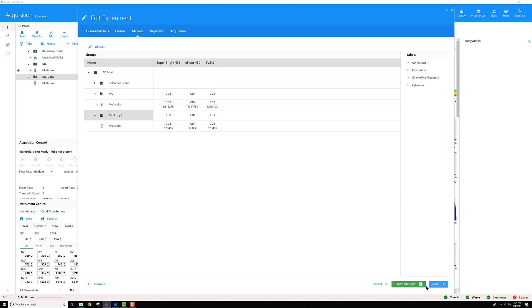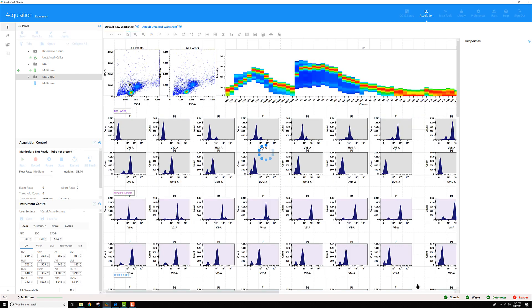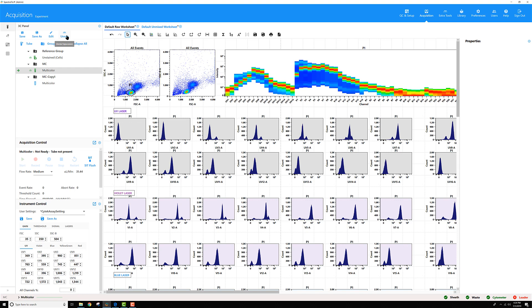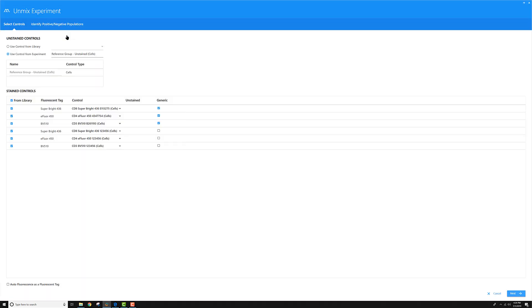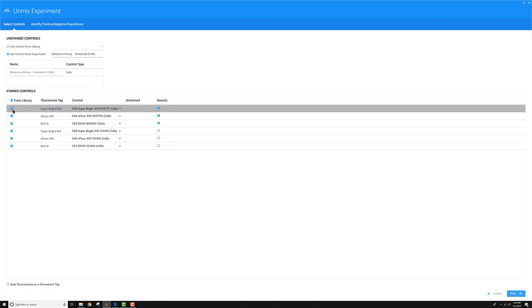When I save this experiment and go to Unmix it, all these controls I have recorded in the library, the reference control library, so they're stored controls.